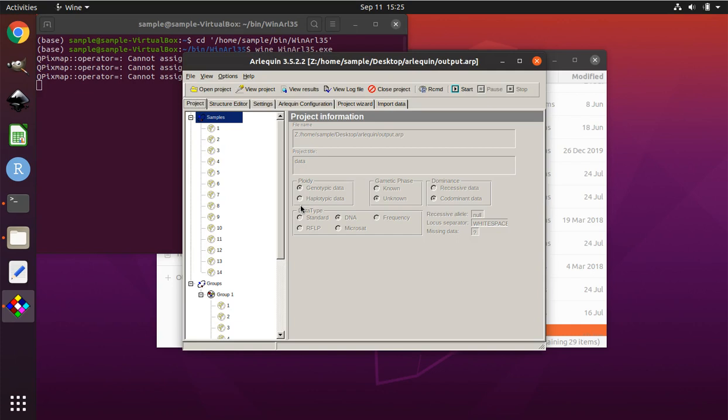Next point. My tutorial assumes the gametic phase of this diploid data is unknown. I think that is better because we will be doing a locus by locus AMOVA, which I believe is superior to the other methods. If you were using haploid data, you wouldn't have to worry about the phase of your data, so that would not be an issue.